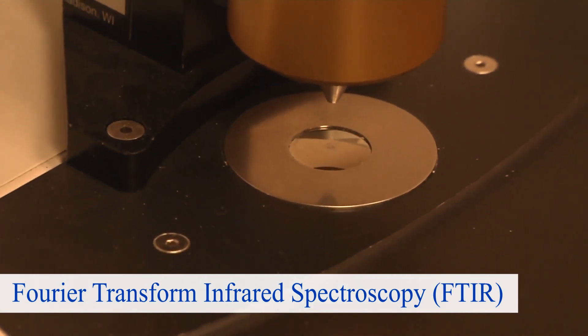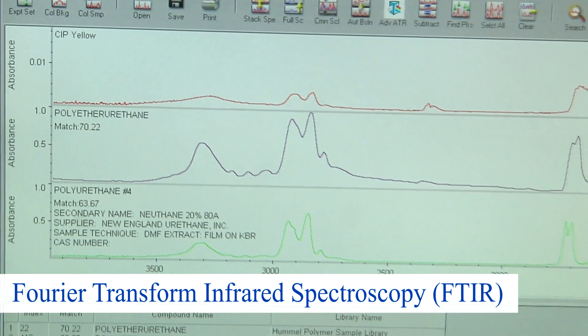Next is the FTIR, which is Fourier Transform Infrared Spectroscopy. We have an FTIR here at TriStar — we're very proud to have this device. It allows us to do some things that a lot of our competition obviously cannot, and it's an investment that sets us apart from many other companies. This test gives us a first look at a polymer, allowing us to take a piece of material sent by a customer and do a quick scan of the chemical footprint of the polymer, helping us determine what the base resin is and if there's anything going on in terms of changes in the material or something that is not supposed to be there. It also helps us identify counterfeit materials.